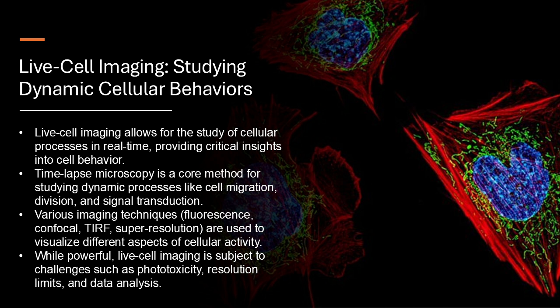Well, this has certainly been a deep dive. It has. I don't know about you, but my brain is officially full. Mine too. We've covered so much ground today, learning about the incredible power of live cell imaging, from time-lapse microscopy to super-resolution techniques. And we've explored how these tools are helping us unlock the secrets of cell migration, division, and signal transduction. Absolutely. It's truly mind-blowing. It's remarkable how far we've come, and it's constantly evolving. There's always something new to discover.